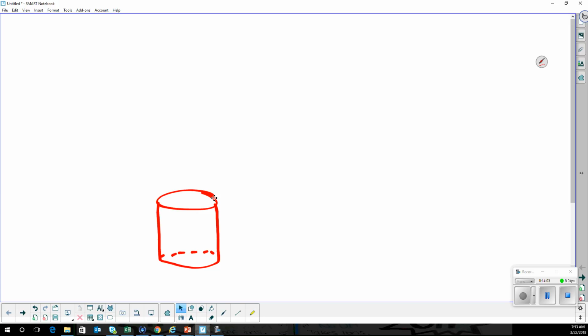You're going to want to do a quick drop so you can see about how much you're going to need, or when you need to slow down so you can get a pretty titration curve. Then you're going to go back, set it up again and do 1 more. So you're actually doing 2 titrations, but one's just the quick drop where you don't put the pH meter or anything in it.